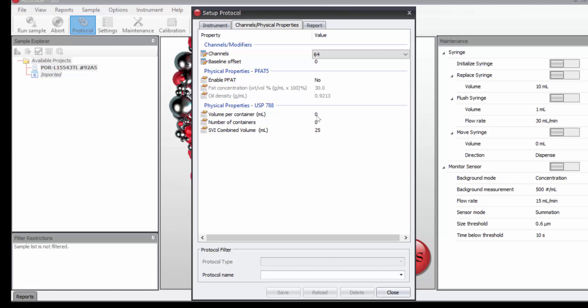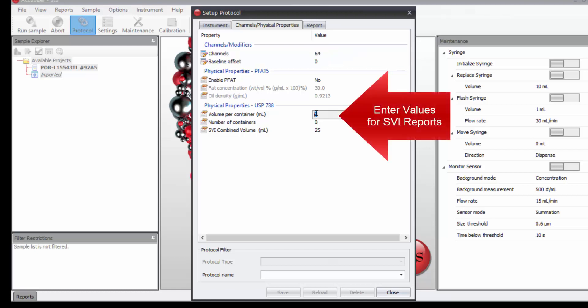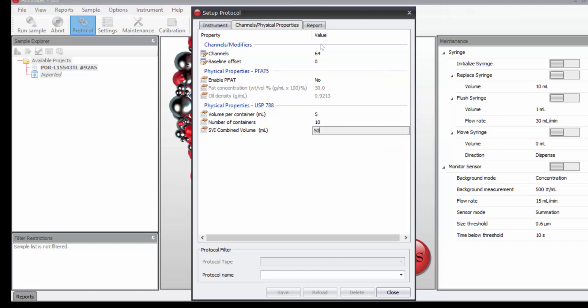And down here, if we're going to do USP 788 testing, if I'm dealing with small volume parenterals, I want to enter the volume per container of the vials I'm combining. Maybe there are 5 mLs. And we must combine at least 10 containers, which would give us a total volume of 50 mLs.